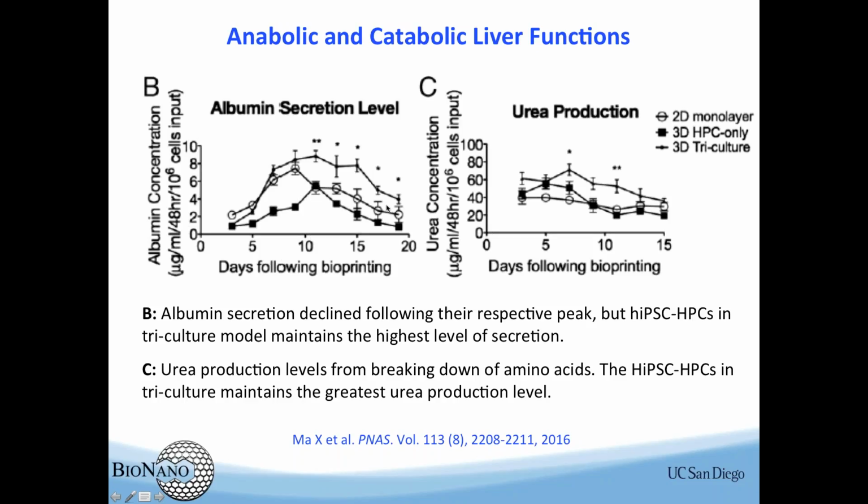I think the reason behind this is that the iPSC-derived hepatic cell is really not mature enough in comparison to real human liver cells. So I think there's work to be done to make this iPSC-derived liver tissue more mature. But definitely, the data support that this is a useful model in terms of function and gene expression.